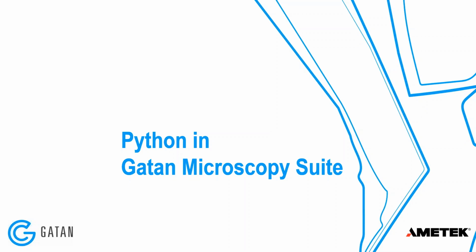And it's also not going to be a presentation that describes in depth how Python was used to answer specific scientific questions based on one data set, like I might present at M&M or the European Microscopy Congress.